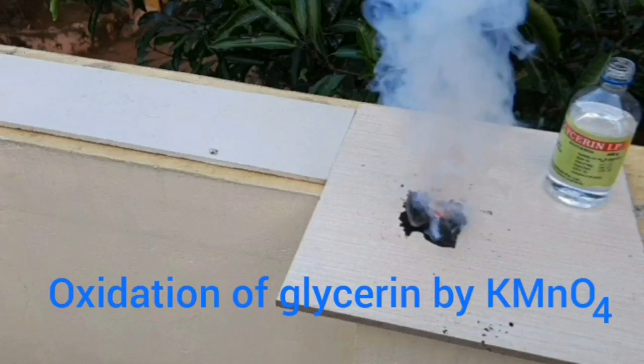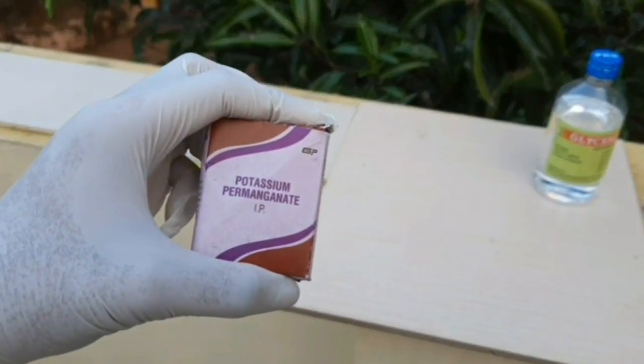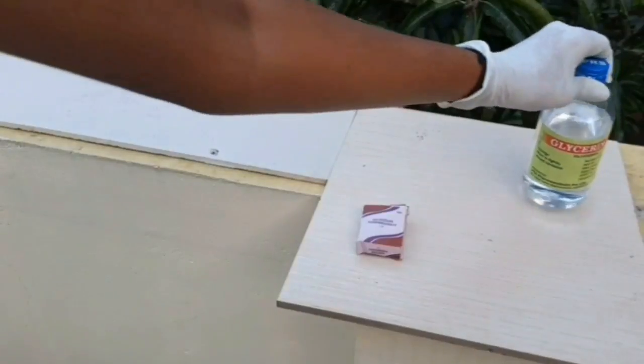In the second experiment we will see the oxidation of glycerin by potassium permanganate. For this we need potassium permanganate and glycerin.